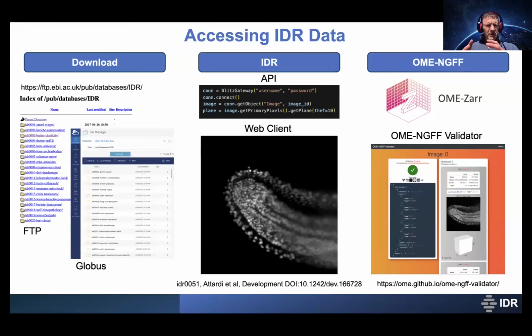That is a factor that we all need to consider, as Teresa alluded to earlier in her presentation. Data are getting very big, and that means moving data is hard. If someone in the US publishes and wants to submit data to IDR or the BioImage Archive, we have to consider how many days it would take, or if it's possible to move this data at all. For some Cell Painting studies, moving the data again is not an option.